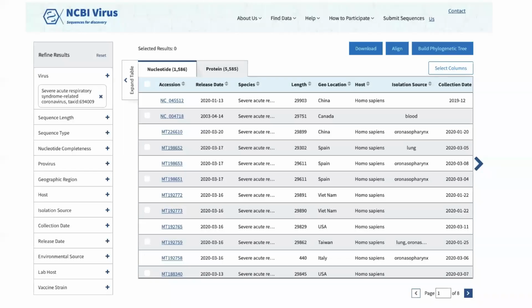So as you can see, you find over 1,500 sequences that are available for us to study, compare, and interrogate. So the question we must ask about the specific sequences that we would like to select for our comparison, when we do so, we have to revisit an important topic that we started speaking about last time. What is the question that we're trying to ask?